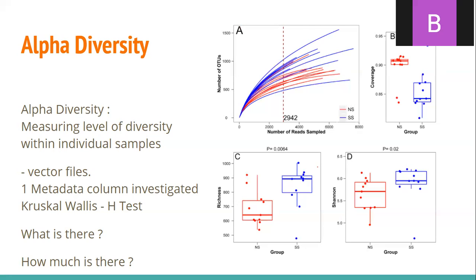For example, my genotypically susceptible Parkinson's disease samples can be measured for diversity with alpha diversity. But if I want to measure the dissimilarity between the wild type genotype and the Parkinson's susceptible genotype samples, it is beta diversity. So it's basically like this.